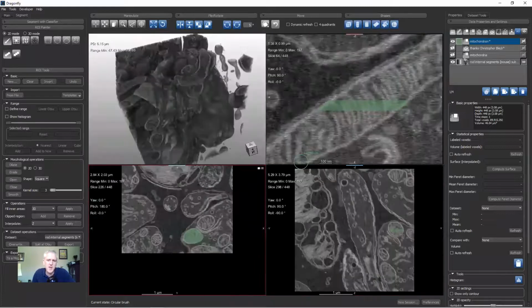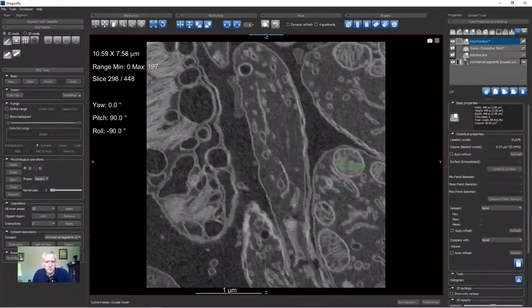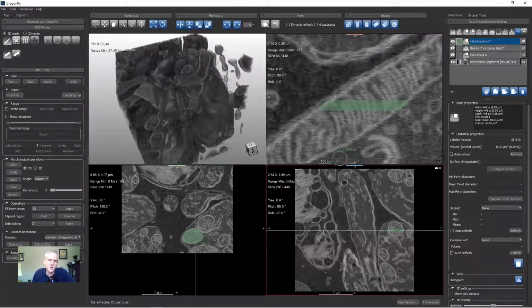The interpolate workflow isn't really that user-friendly. You can do it if you're working on an individual object. You can see that it gave us the results we wanted, but the way we normally do painting, where you iterate, I think you're not going to find it that useful for most workflows, but we can have a discussion offline about that if you like. So that was just very, very simple painting and interpolate.